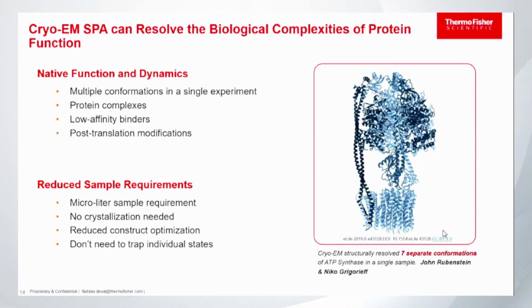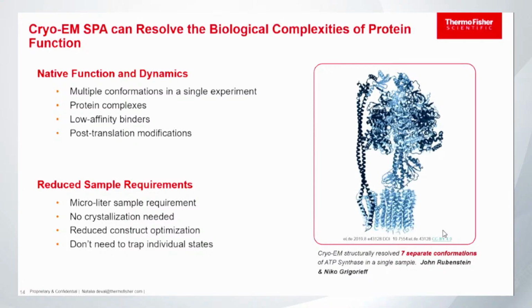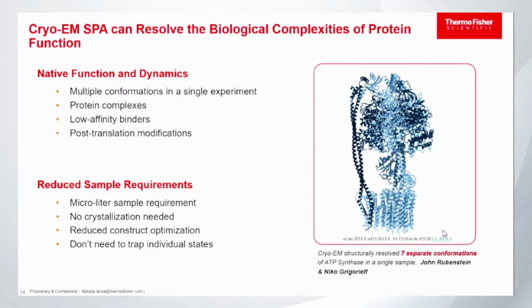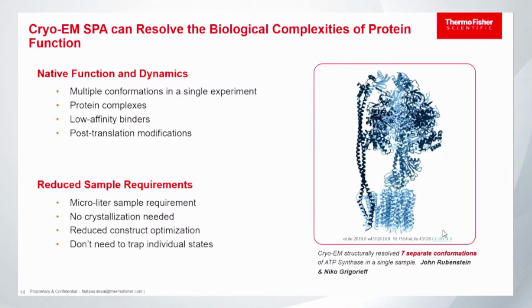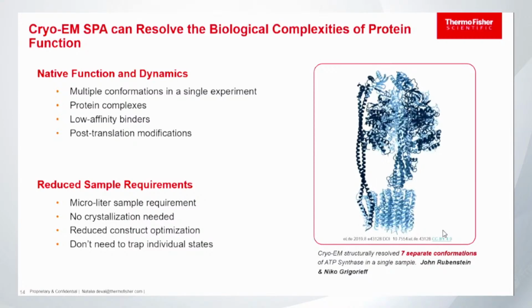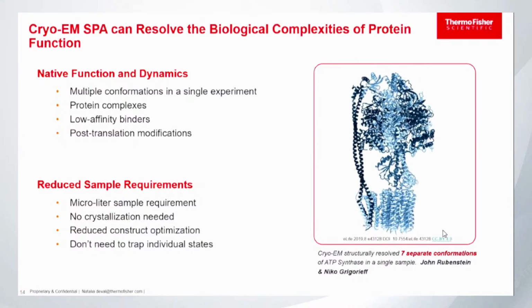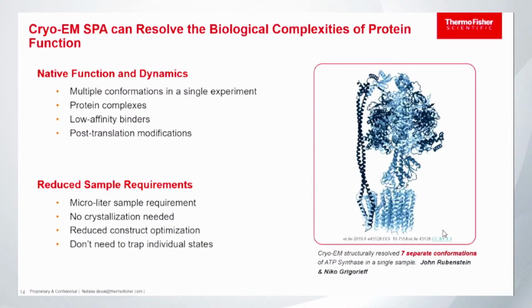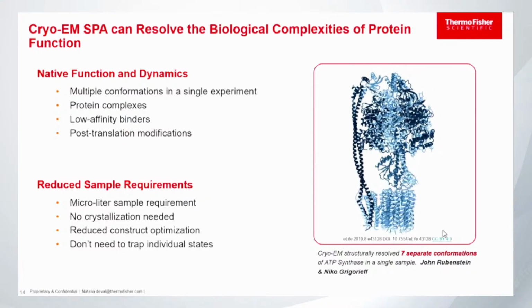Sometimes in crystallography, as you know, when I was working again with the PI in crystallography, it's like, I need 10 milligrams per milliliter of this protein. I was like, are you kidding me? I cannot even produce 1 milligram per ml. How you want me to produce 10 milligrams per ml? That's crazy. So the amount of protein you need sometimes to crystallize is very huge, and some systems are very difficult to produce. So in this case, single particle, you need very small amount. So that is very cool as well.